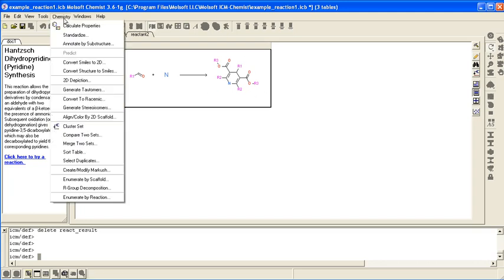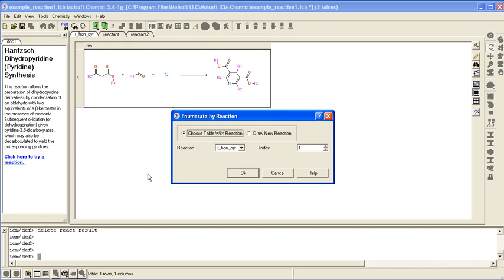So if you go to chemistry, enumerate by reaction. You choose the table with the reaction which is this one. Index 1 which is row 1.